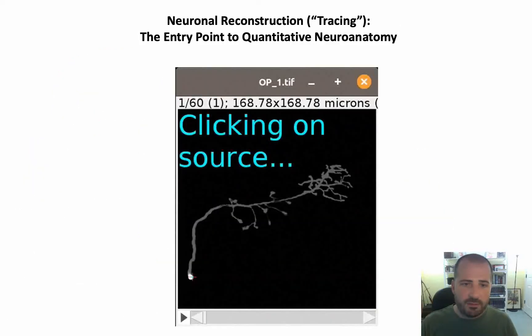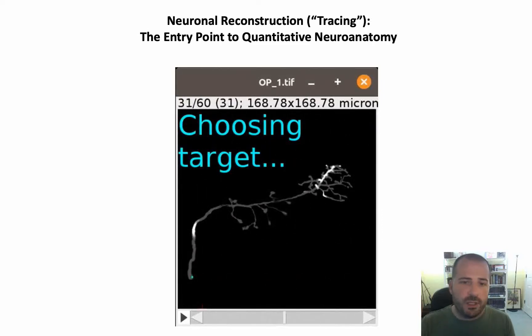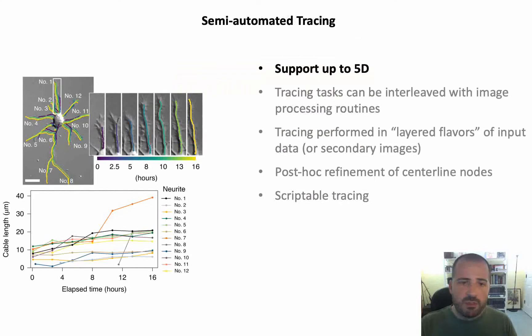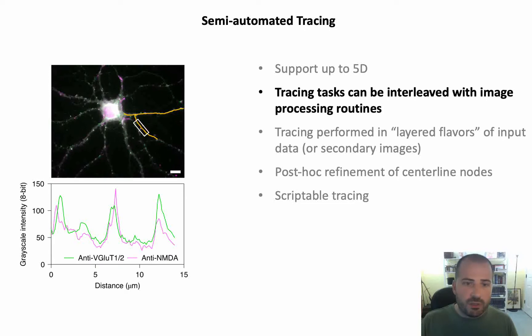Just to put things into perspective, this is how neurons are reconstructed in SNT. Users click on the start and end of a neurite and the program computes or traces the path between the two points. It is a highly supervised segmentation routine that requires human interaction, but yields the most accurate results. A couple of distinctive features of SNT include support of up to 5D images and the ability to interleave tracing tasks with other routines, as in this example where intensity profiles of traced paths were obtained to identify sites of synapses along dendrites.